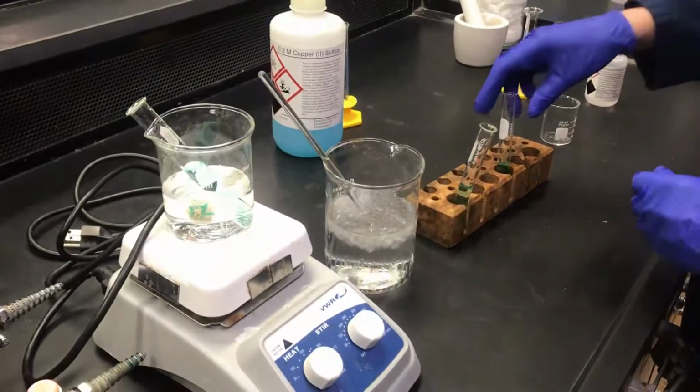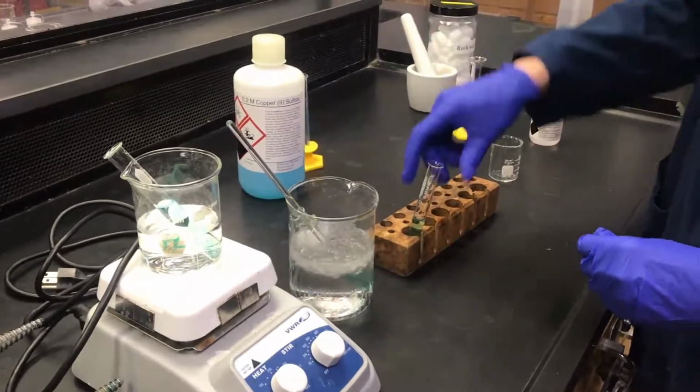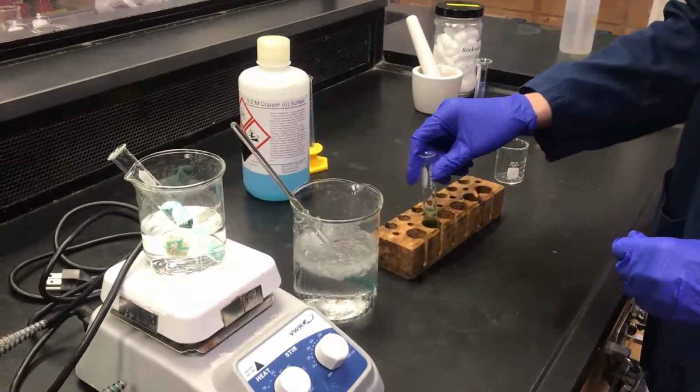And we'll let these sit for about 15 minutes. So in the next part of the video, we will be viewing the part 1 results.